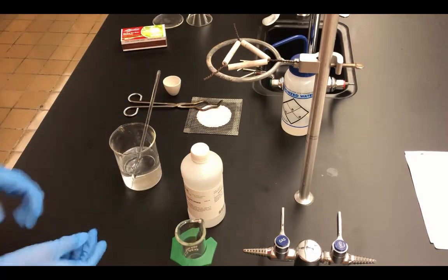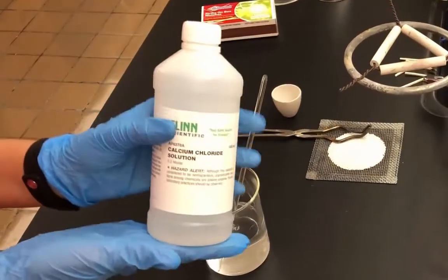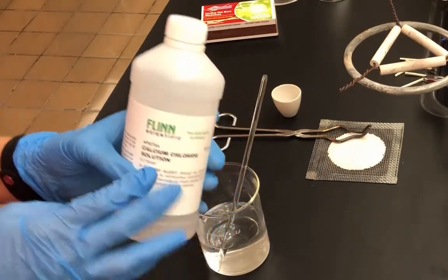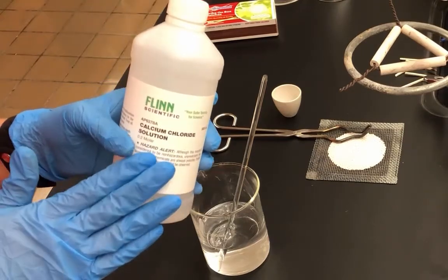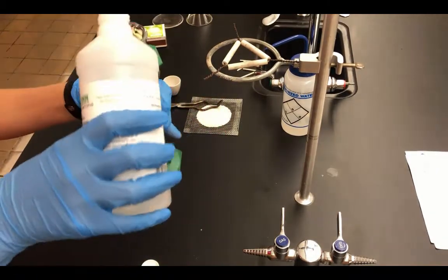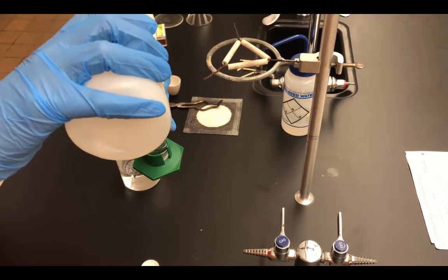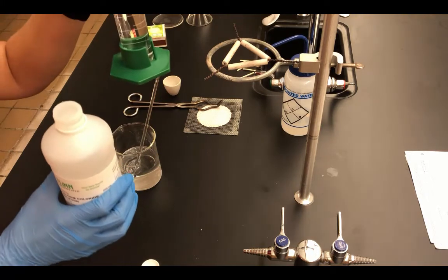Now we're going to add 125 milliliters of this 0.2 molar calcium chloride solution. This is exactly 0.2 molar, so make sure you record the exact concentration in your lab notebook. For 125 milliliters, I have this 100 milliliter graduated cylinder, so I'm going to pour to the 100 line. You want to make sure you read it at eye level.